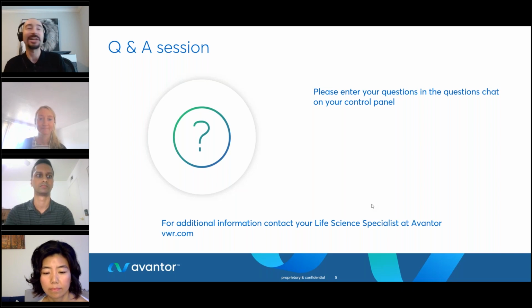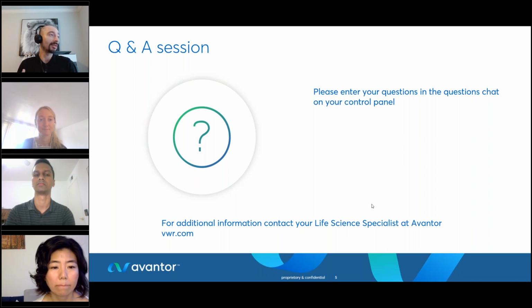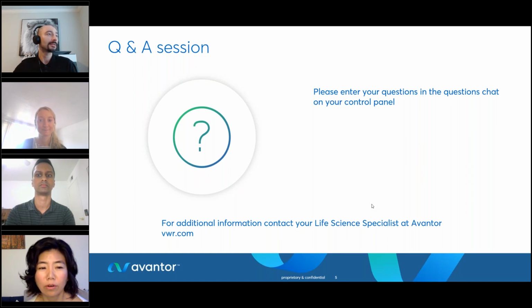Thank you. Jan, the next question is for you. When multiplexing short and very long plasmids, is there a risk to get low coverage of the large plasmids and thus the failure of sequencing verification? There shouldn't be a big difference between long and short plasmids. Also, the user can visualize the coverage in real time in MinKNOW during sequencing, and we also have a barcode balancing option, so that you can get relatively equal coverage across different size plasmids, and then stop the run. Yeah. Thank you.